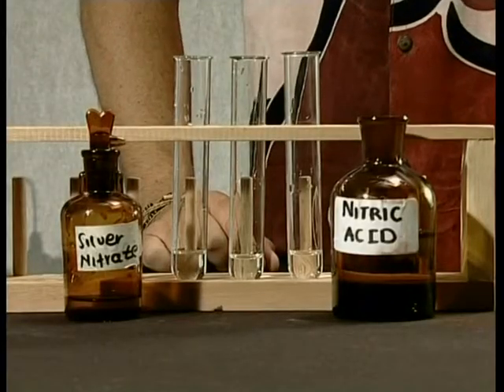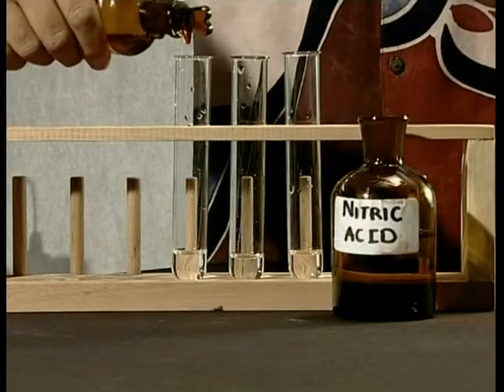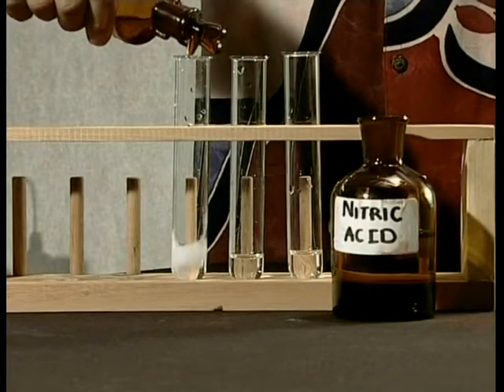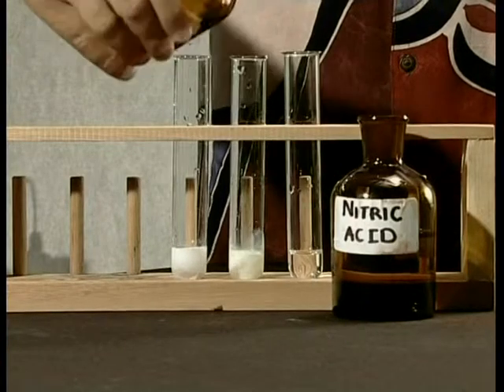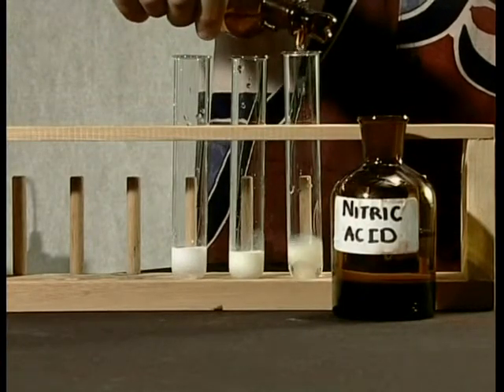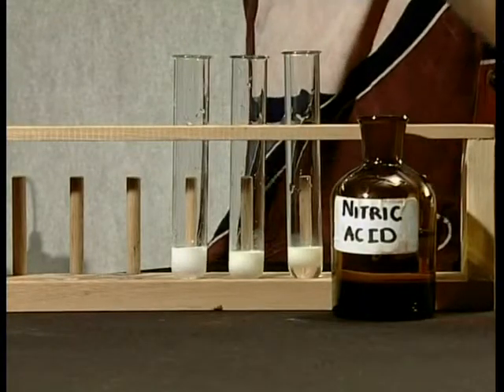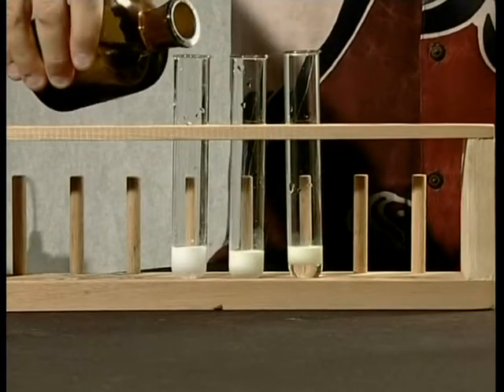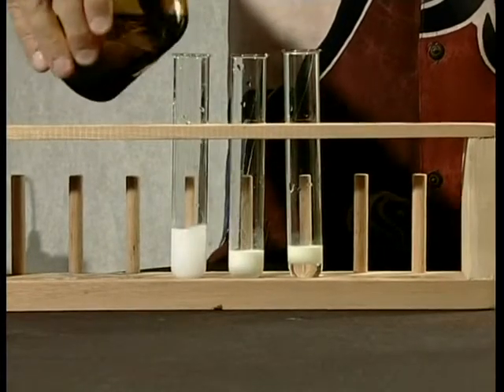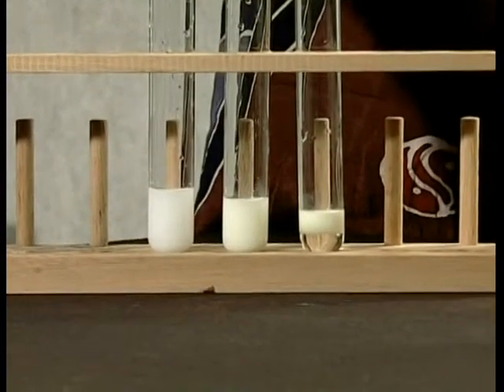We need to place a little of each halide in a test tube and then add a few drops of the solution silver nitrate to each test tube. After a few minutes, add a few drops of nitric acid to each test tube. Look carefully at what happens in each of the test tubes and take note of what you see.